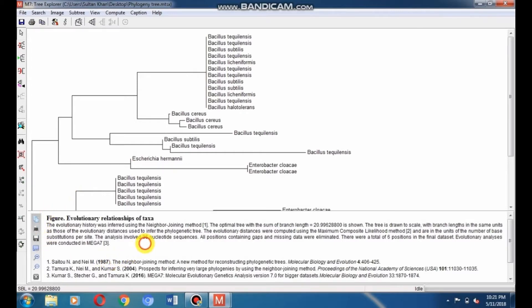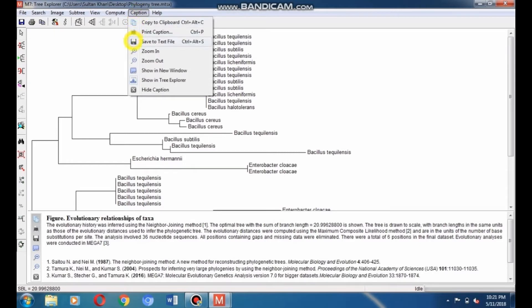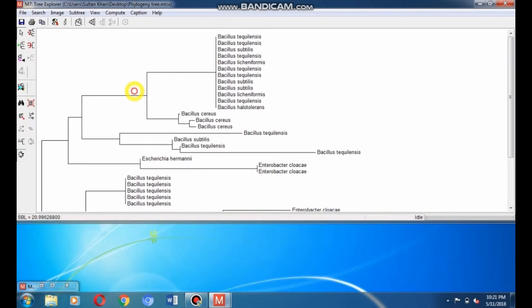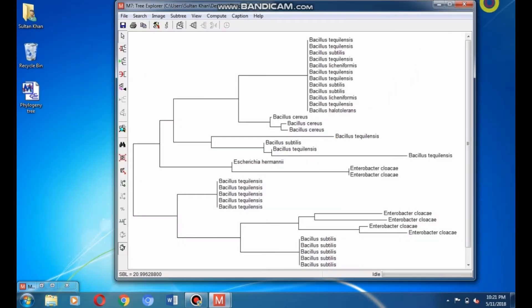Here you can see the description of the phylogeny tree. You can hide it by going to Caption and selecting the hide caption option. Now maximize the window of the phylogeny tree.